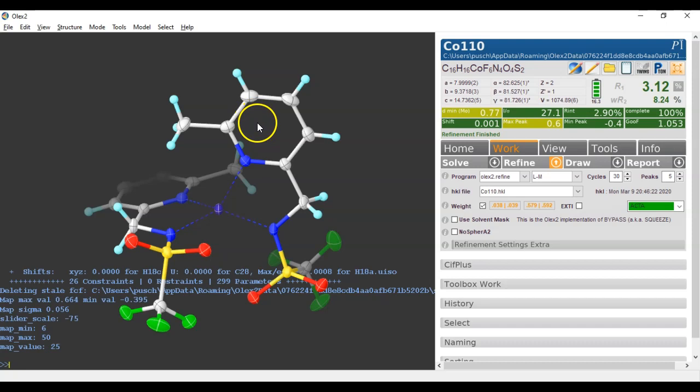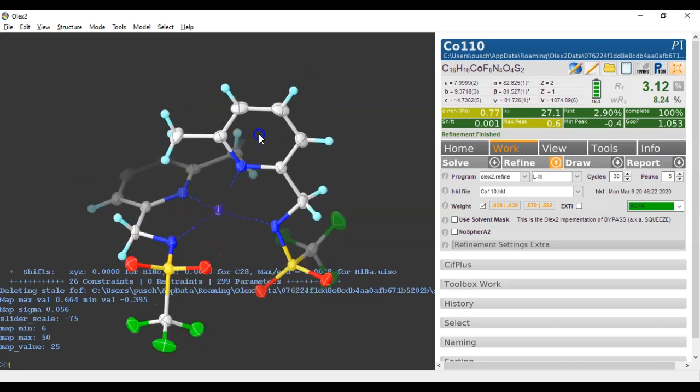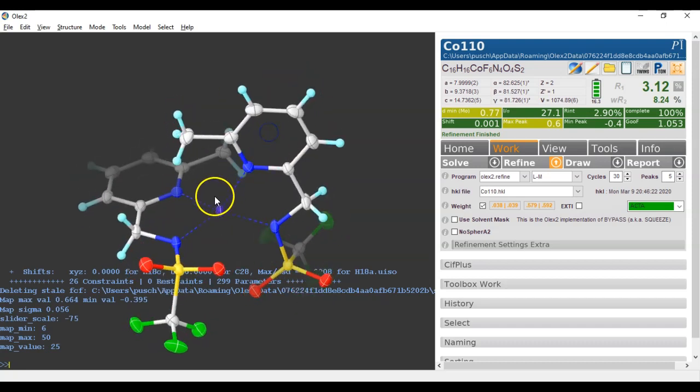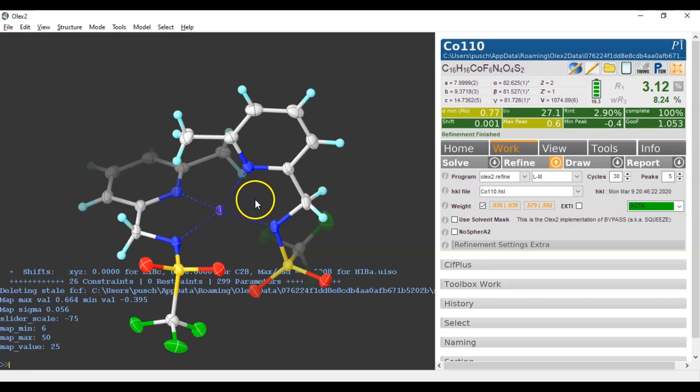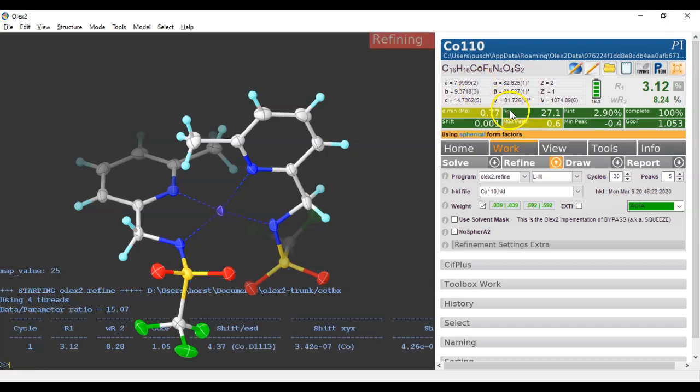Now in Olex 2 Refine you can do something new. You can try refining some selected atoms anharmonically. So I click on this metal and type ANIS -A. This is how you switch it on, and we're going to refine this.